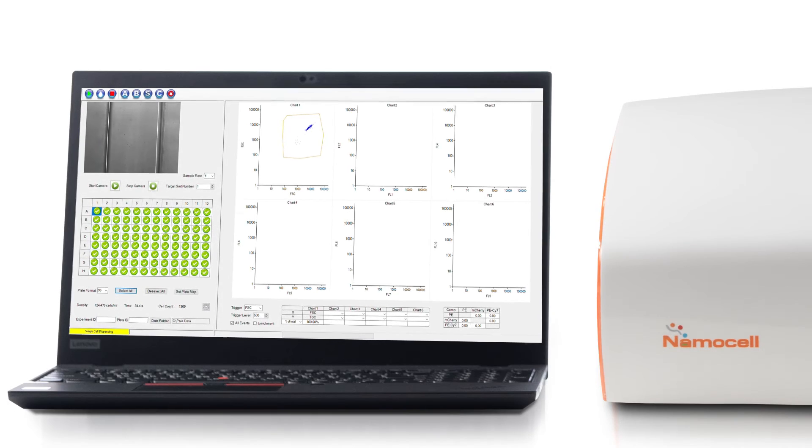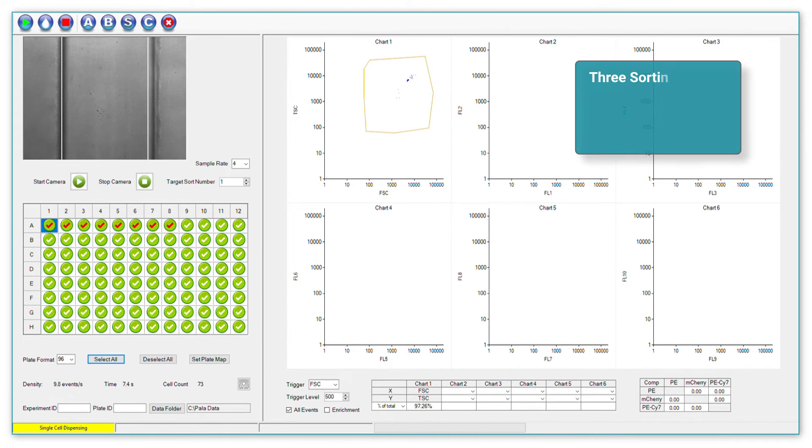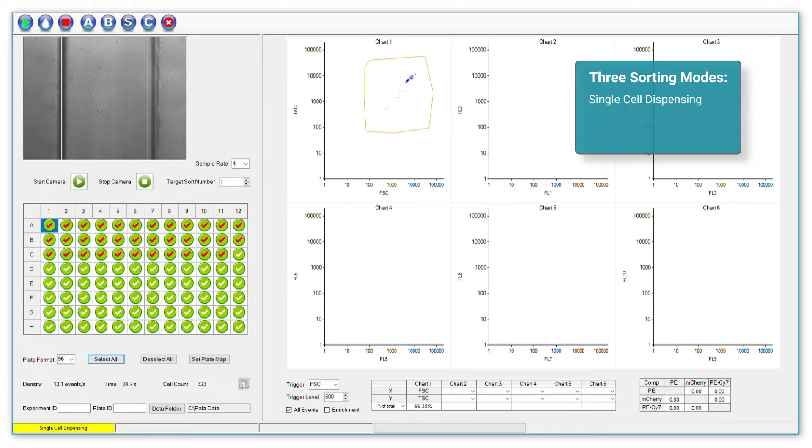Setting up the dispensing run is simple. First, select the mode according to your needs. The Single Cell Dispensing Mode dispenses one cell per well. The Target Cell Enrichment Mode isolates rare cells from extremely large samples. And the Bulk Cell Sorting Mode sorts tens of thousands of cells in bulk.